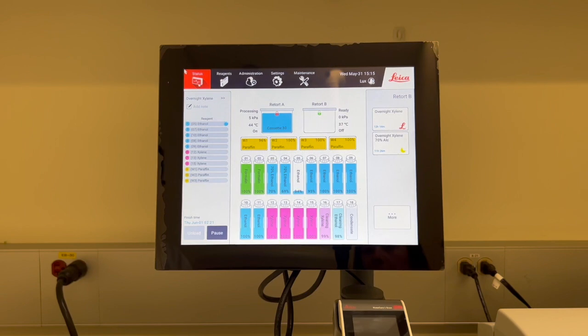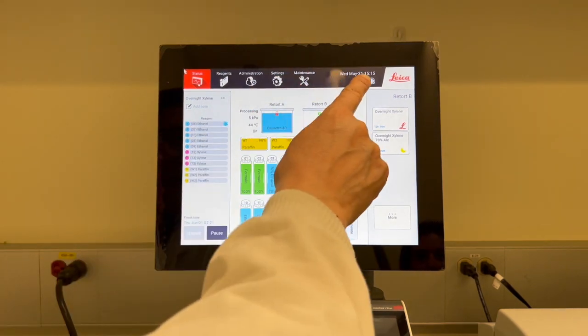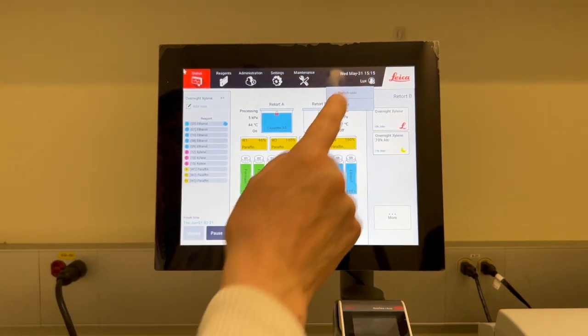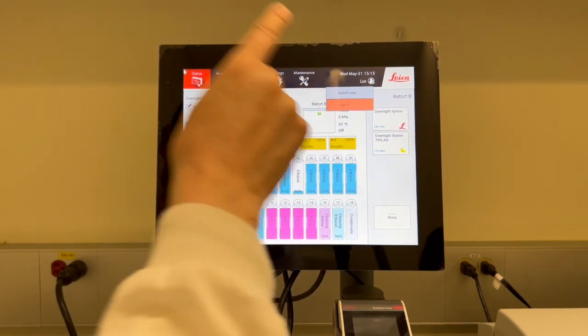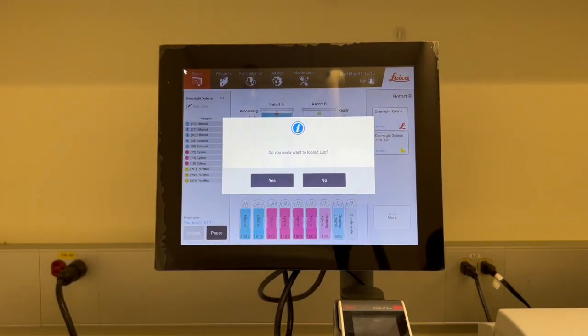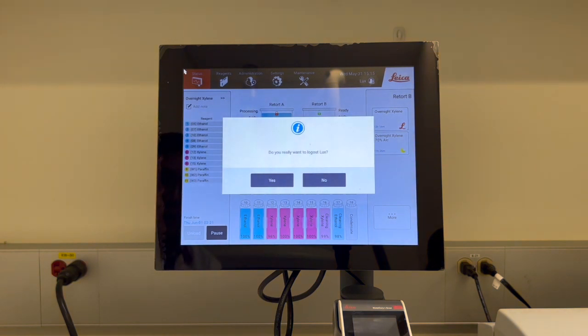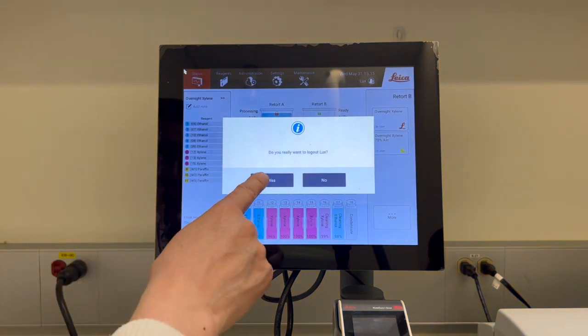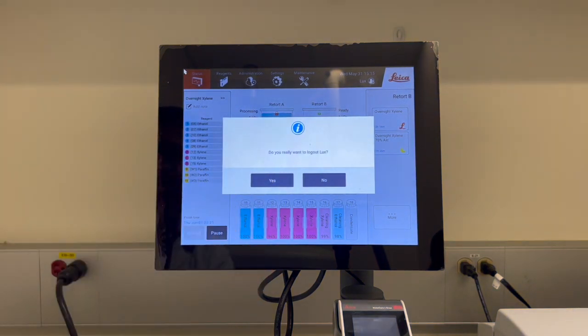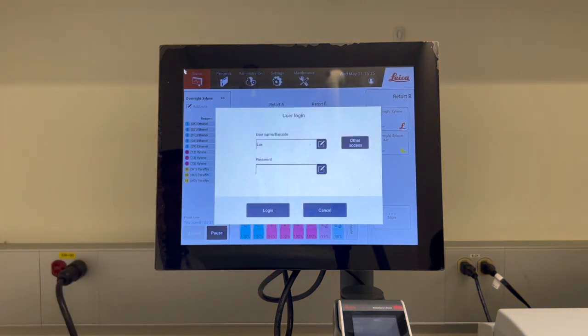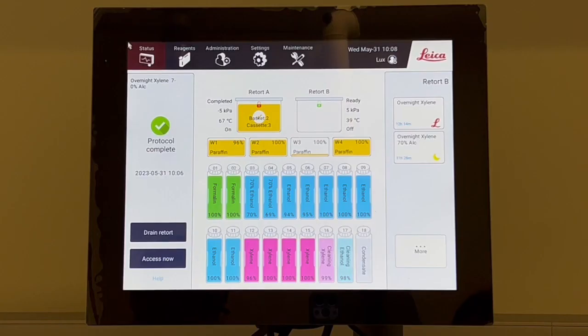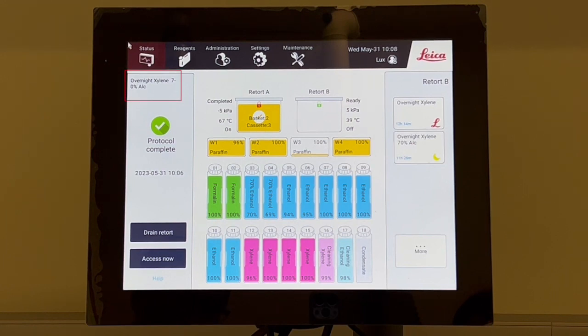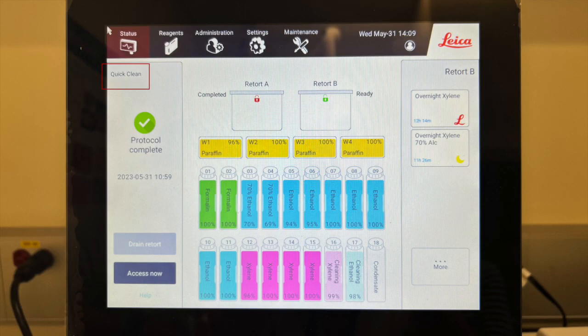Once you are finished, press this icon to log out, or the process will automatically log you out in 15 minutes if no one touches the screen. Please remember, every time you must run two protocols on this new Pegasus processor. The first is your tissue processing protocol, and the second is the clean now protocol. That way, the processor will be ready for the next user.